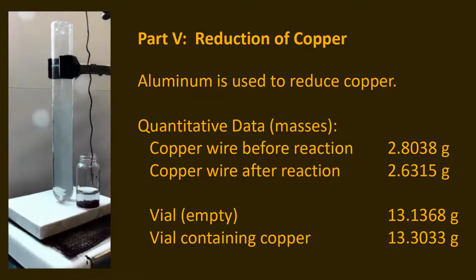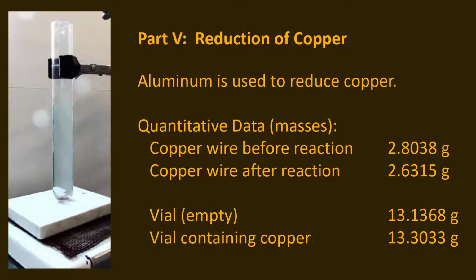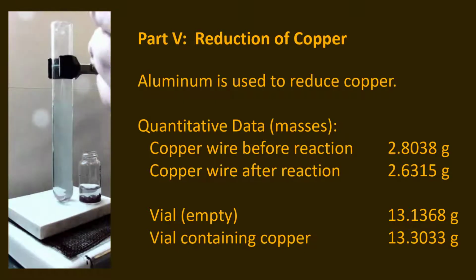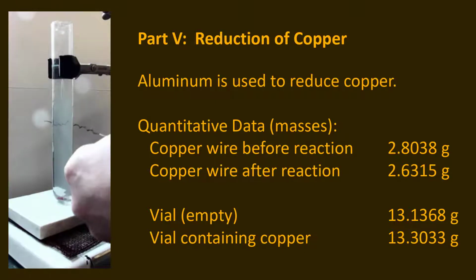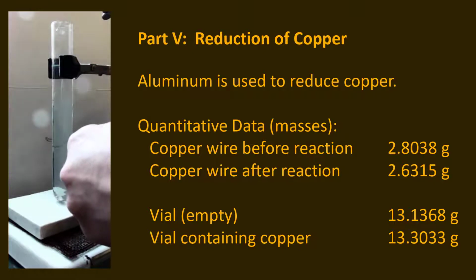And so what I'm going to do is use a spatula to, as near as I can, scrape this material off and into the flask.